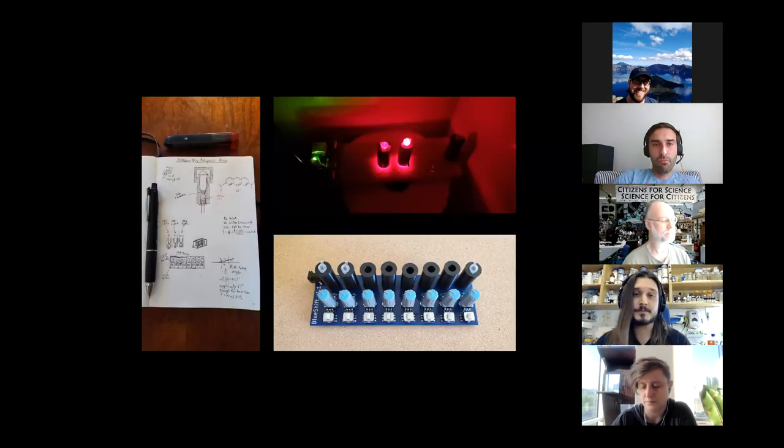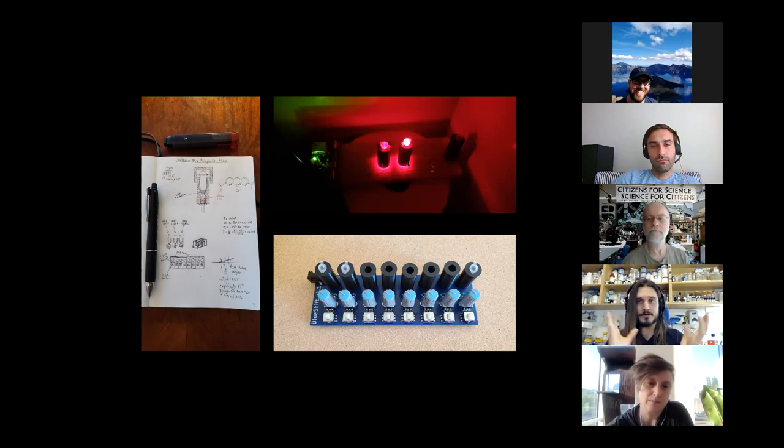Here's a really fun one. I'm super excited about this, right? So I would love to work with mutagens, but all mutagens are carcinogens. Right. So EMS for plants, right? You just put a couple drops into some seeds and then they come out looking all crazy. If you get that on your skin, there's a high likelihood that it becomes carcinogenic.